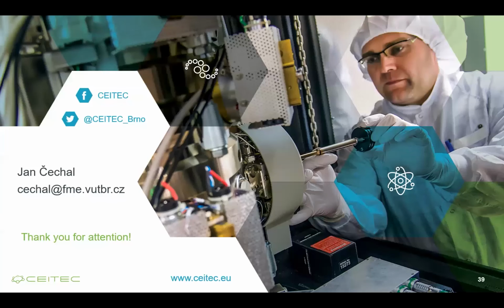One important thing, this is the second part of the question, is that we need UHV, and UHV compatible samples. So in principle, if the biopolymers are UHV compatible, then they can be imaged. The second important point, if we want to see diffraction, it should be crystalline, single crystalline, and also it should be clean.